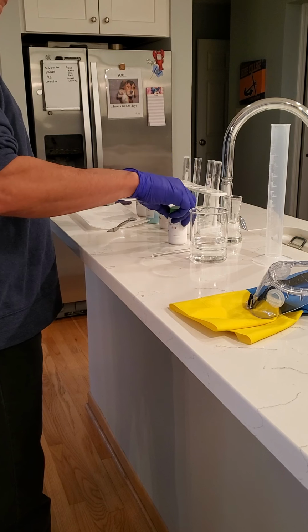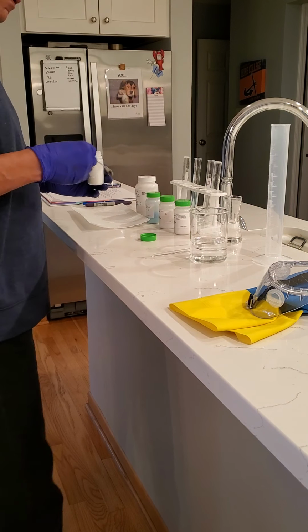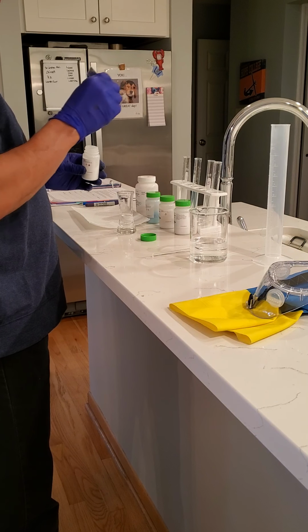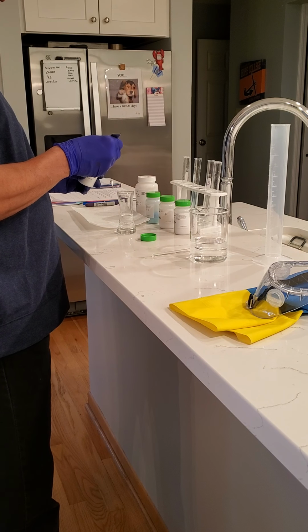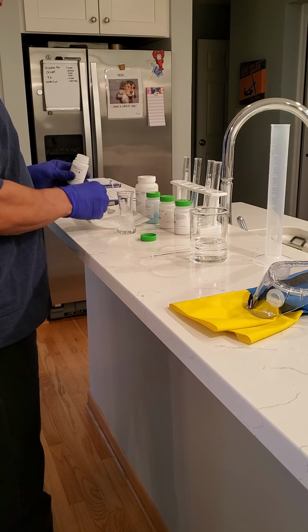Then the last one is the sodium borate. So we'll take, if you have a 5th test tube, that's great, or you might have to wait and get another one that's available. We're going to add a little bit of the sodium tetraborate to a few mils of water.